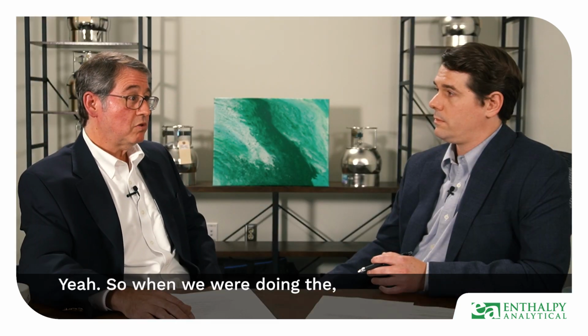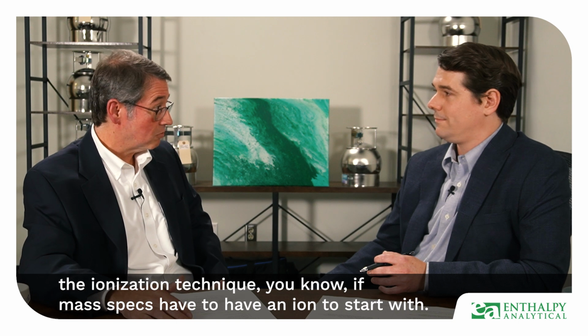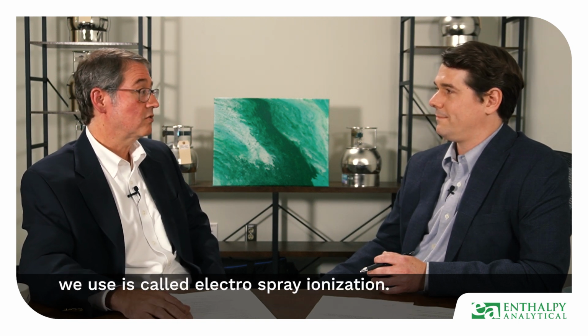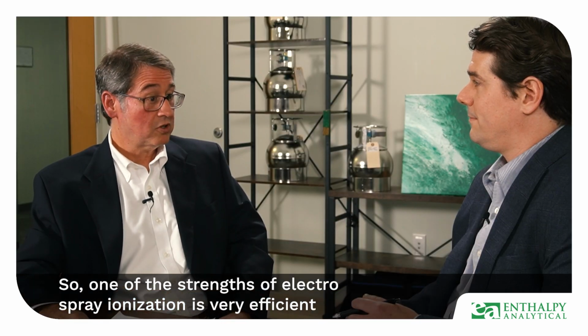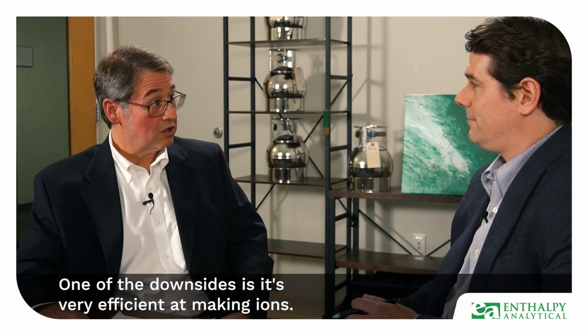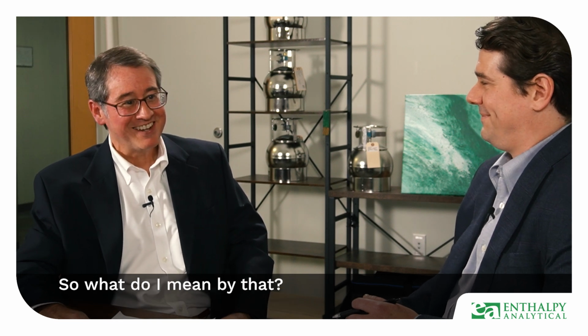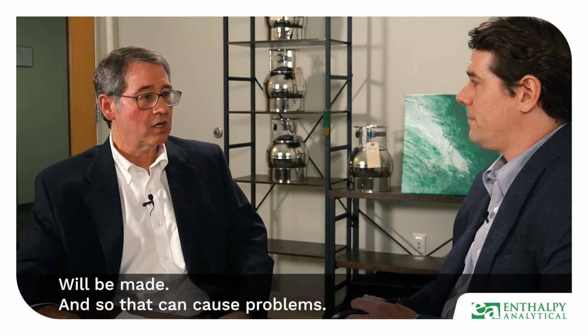Yeah, so the analysis itself is a technique called LC-MS/MS. The ionization technique, mass specs have to have an ion to start with, so you have to make an ion. The ionization technique we use is called electrospray ionization. So one of the strengths of electrospray ionization is that it's very efficient at making the ions. One of the downsides is it's very efficient at making ions. So what do I mean by that? Anything that can make a negative ion, we're running for PFAS in negative ion mode, will be made. And so that can cause problems.